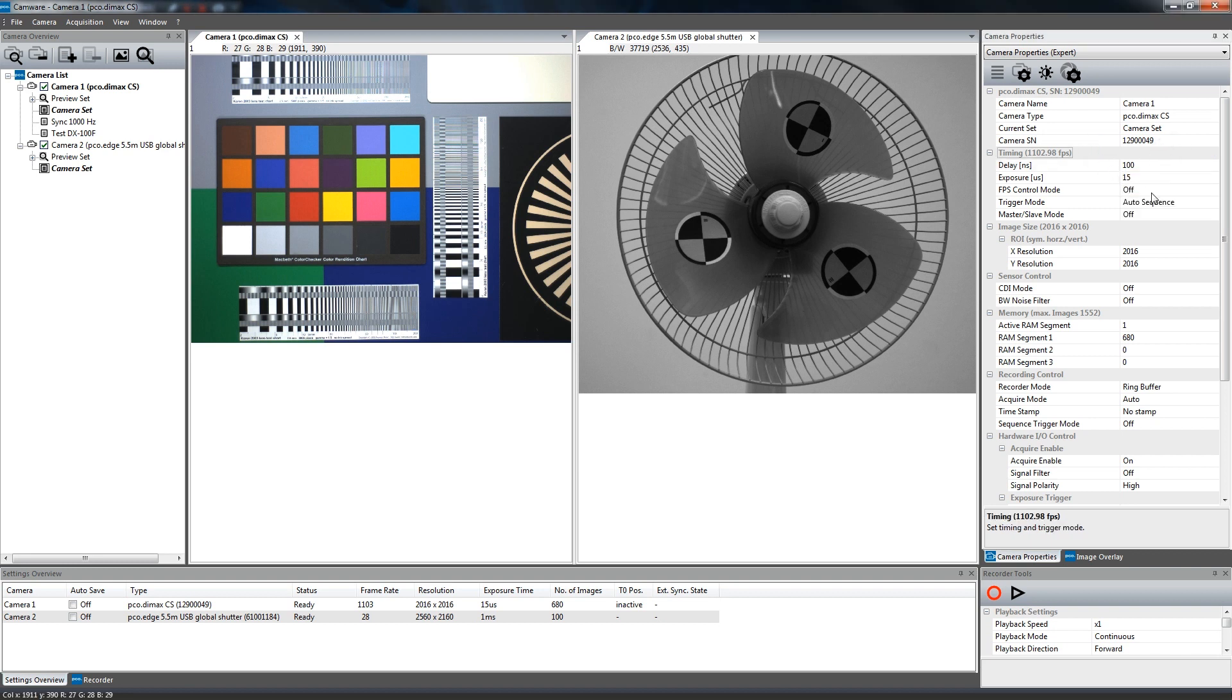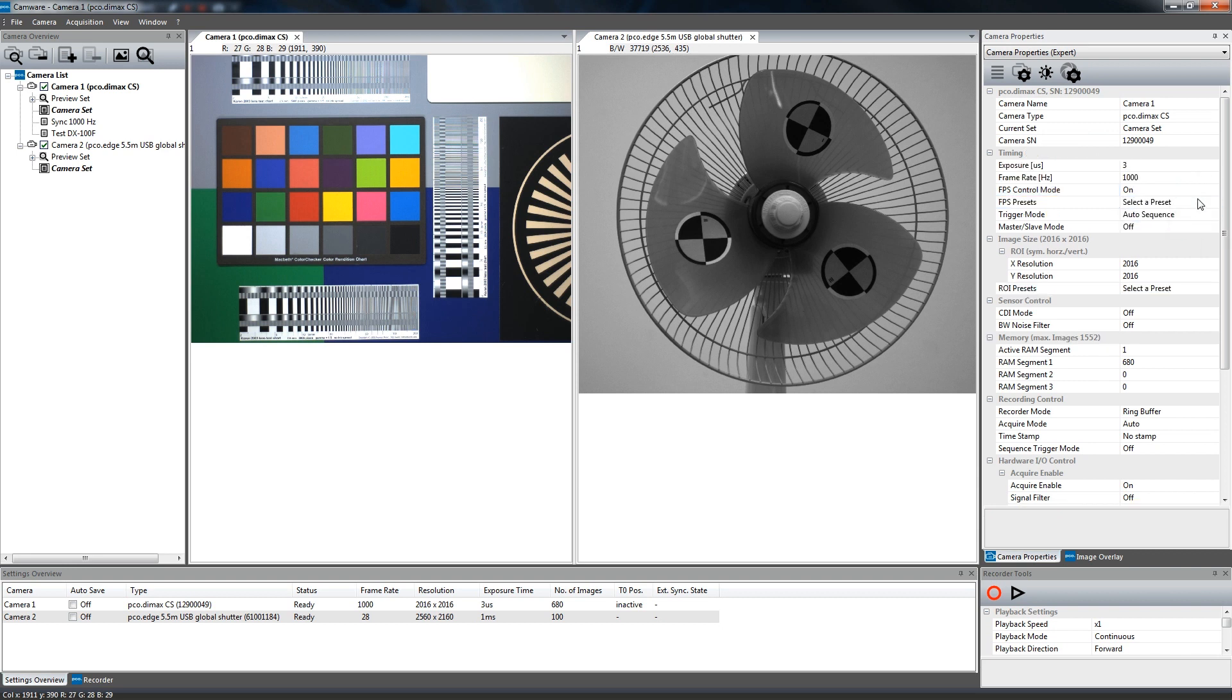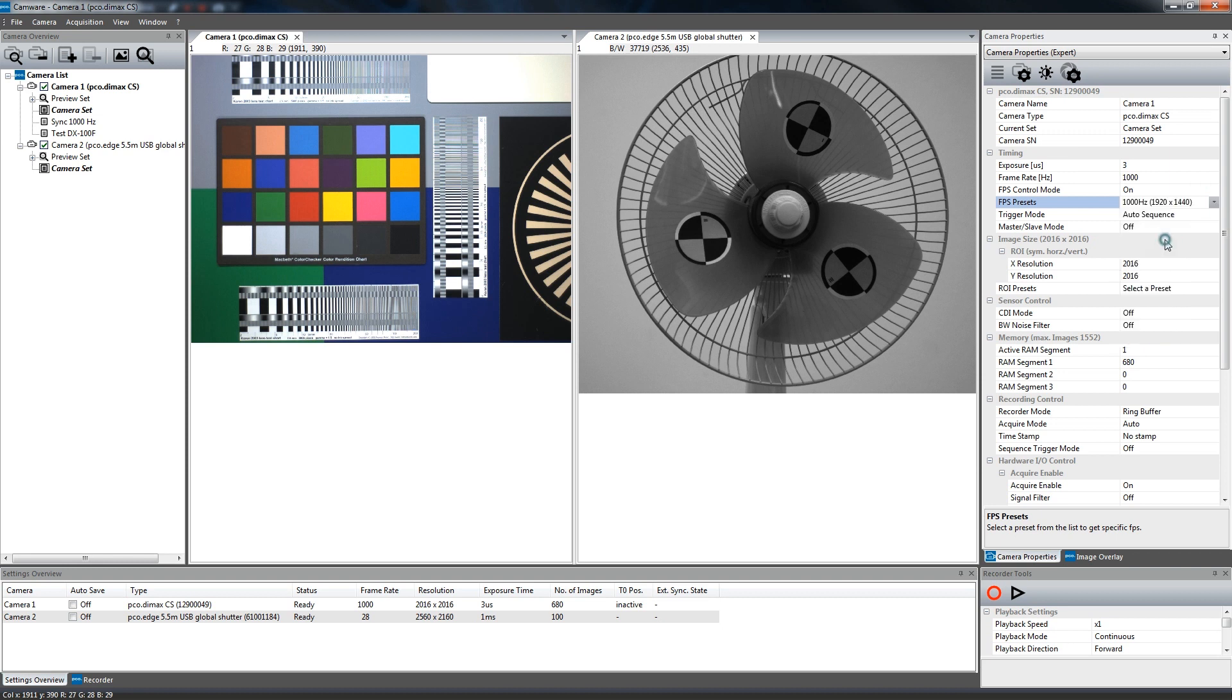Set FPS base mode to on and select a proper frame rate in the provided list. The camera optimizes the image recording to achieve the selected frame rate.